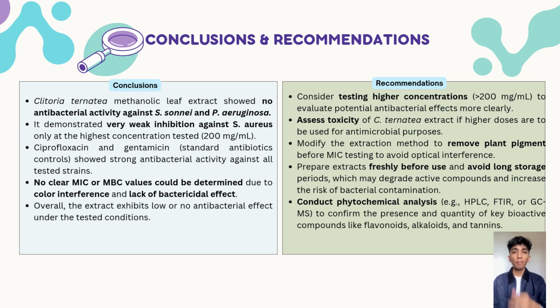For further study, I recommend testing higher concentrations above 200 mg per ml and assessing toxicity if those doses are to be used as antimicrobial agents. The extraction method should also be improved, especially to remove plant pigments before MIC testing to avoid optical interference.